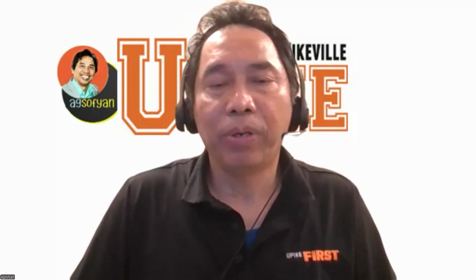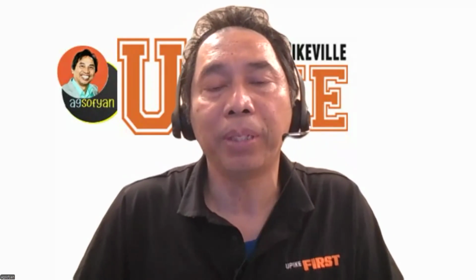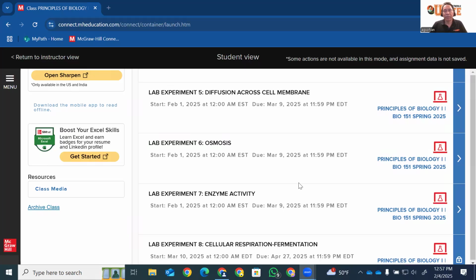Hi everyone. I want to give you an example of how to do lab experiments using McGraw Hill Connect. I will share my screen. Again, after you log into McGraw Hill Connect, you should be able to see choices of lab experiments. For this example, I'm going to show you how to do the lab experiment on enzyme activity.